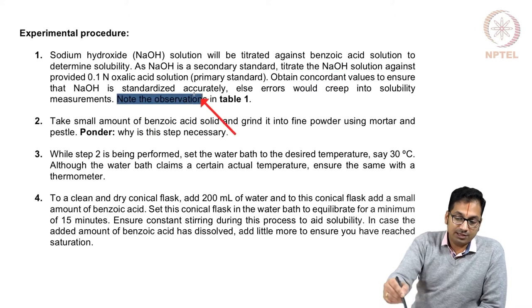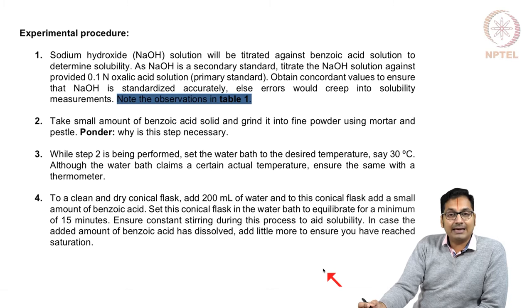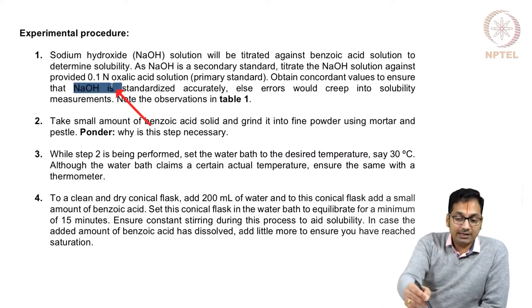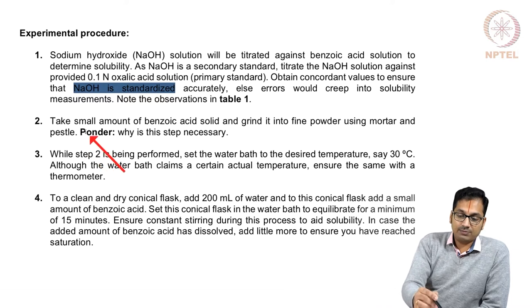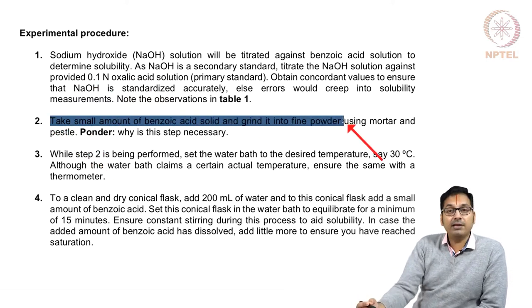And generally we would like to make tables like the table that we made for the last class to standardize or to calibrate the burette. Here also we will make a table, so that the first step of this table would be the standardization of sodium hydroxide solution. Okay, now having done that, take a small amount of benzoic acid and grind it into fine powder using the mortar and pestle.